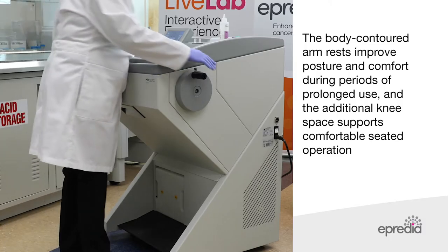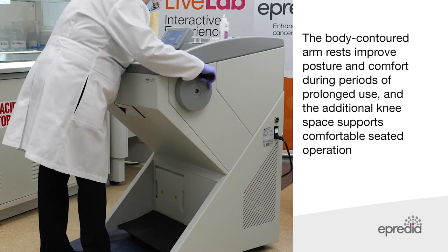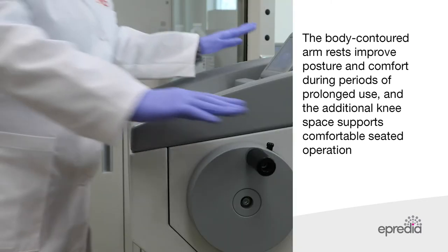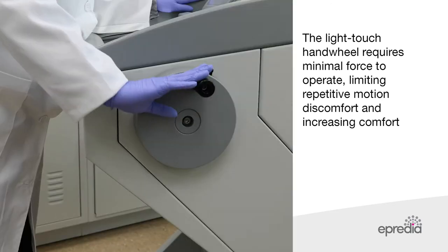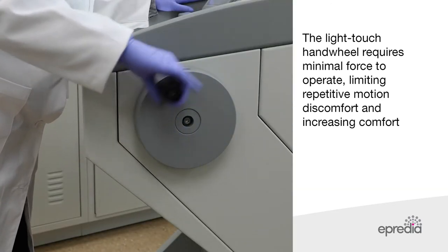The body-contoured armrests improve posture and comfort during periods of prolonged use, and the additional knee space supports comfortable seated operation. The light touch hand wheel requires minimal force to operate, limiting repetitive motion discomfort and increasing comfort overall.